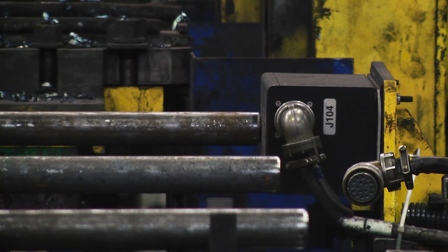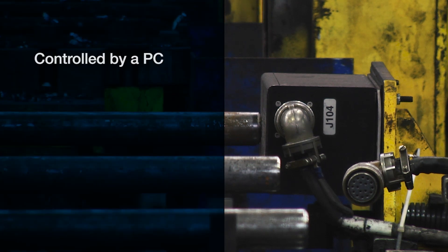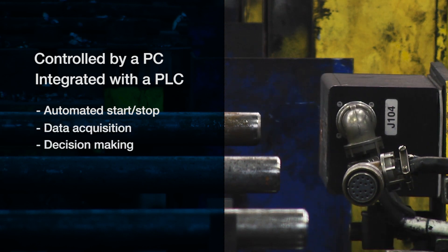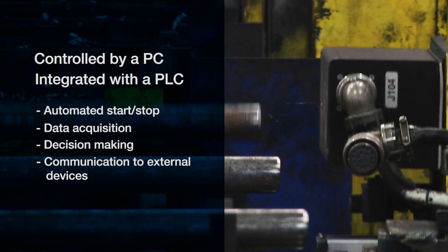The FOXIQ analyzer can be controlled by a PC or integrated with a PLC for automated start-stop, data acquisition, decision-making, and communication to external devices.